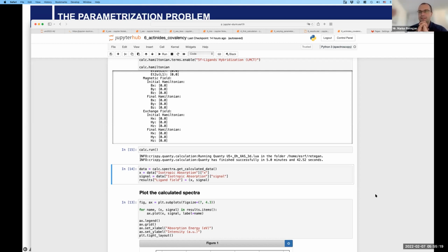Yes, I agree. We do the same. If you really rely on quick EXAFS, then you have to get into programming, because you get thousands of files, but I'm not so sure if you run so much quick EXAFS in the future. If you do RIXS also you need it, because RIXS in Hamburg has this file format which you directly import. But luckily in Hamburg again there is a person who did a graphical user interface for that. I think this will be the solution, that they have to do it for us, because if you go to many synchrotrons, you cannot write your own graphical user interface all the time, or they agree on the data format. Which I see as difficult.